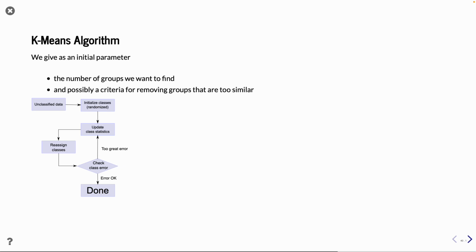Then for each class value, you compute the centroids, or the average value. Probably in the beginning they're very close to each other, but you always take the closest class and reassign, and then you update this class map until stability. In the end, you come out with this final segmentation or clustering, and you are done.